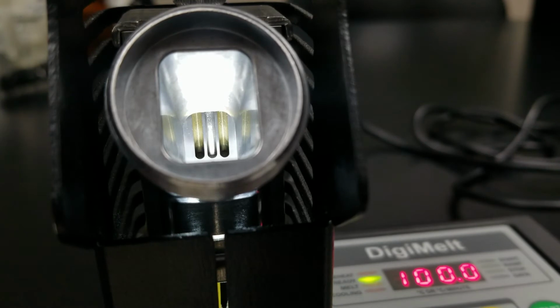Okay, everybody, we're at the final moment of truth. This is our main assessment of purity today. We're not getting any spectra. So, the expected melting point is 114, 115, that range? Yeah, so I set the start point here to 100. And we only have the one tube in there today. That's the one in the middle. So, as usual, enjoy the show.